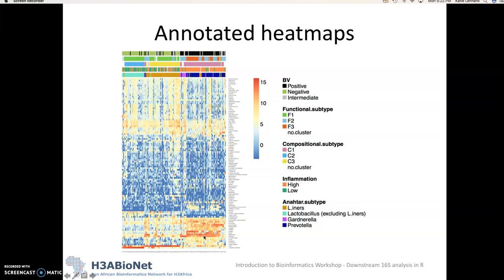Otherwise if you have certain really high abundance ASVs it makes it a bit harder to visualize on a nice color scale like we have here.